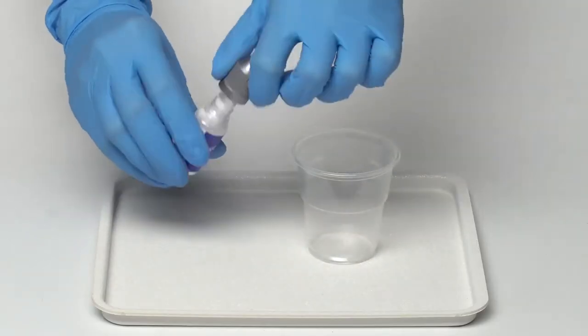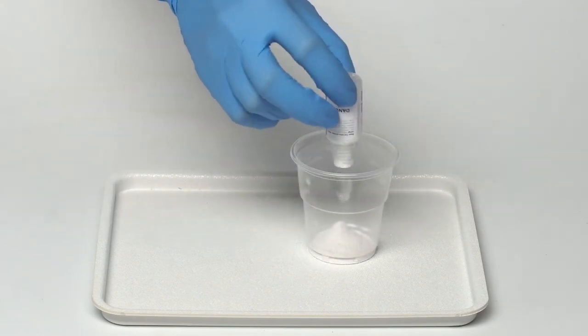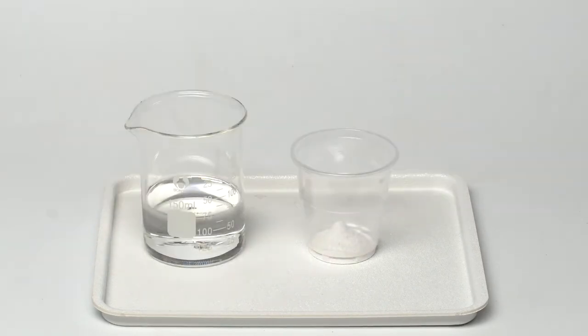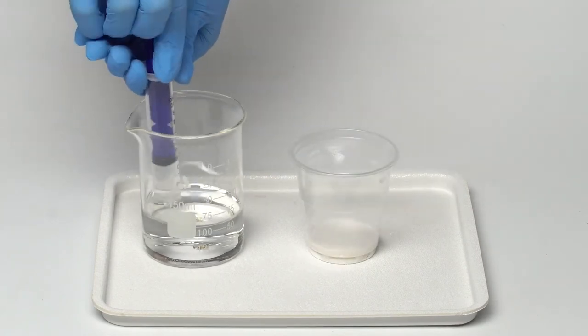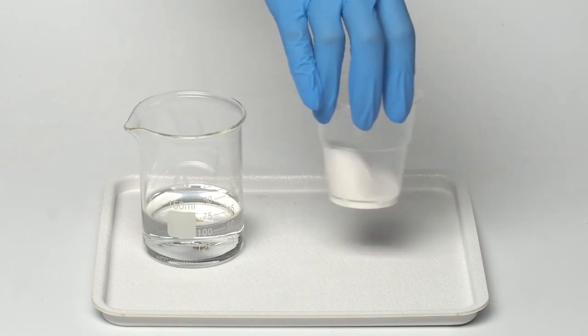Pour the entire bottle of calcium hydroxide into the first plastic cup. Using the syringe, add 15 milliliters of water to the cup and mix the contents with a swirling motion.